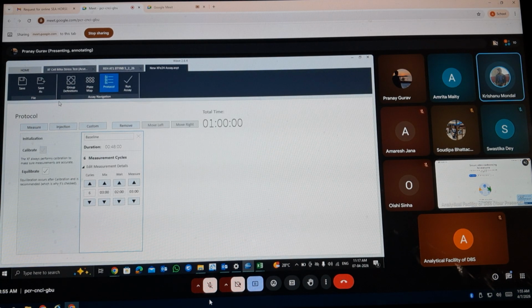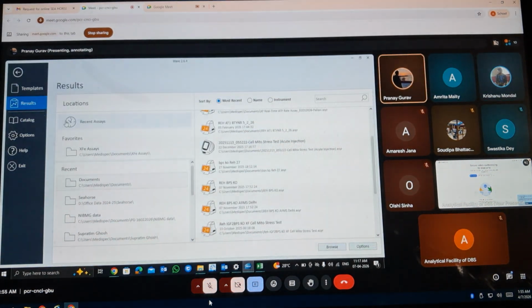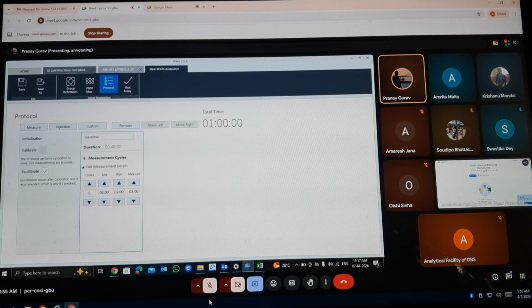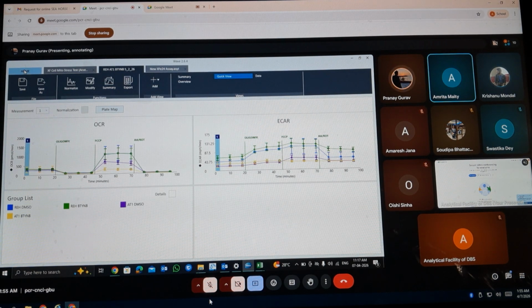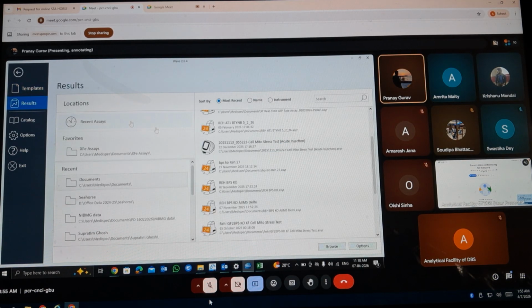Can't we do it apart from the normalization part you have shown to me before, the protein normalization stuff, for the black experiment? Yes, for that you can. There is an option in normalization. I think I saw it. Yes, there is an option.